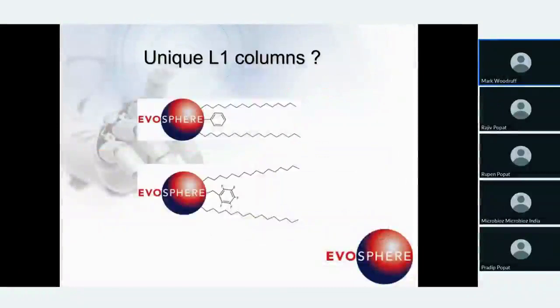So I said a moment ago, which of these L1 columns would you choose? Well, that's a good advantage to have, that there are multiple choices here. Traditional C18 columns, so your Hypersil Golds, your Fortis C18, your SunFire C18s, your Luna C18s, are predominantly C18 ligand with a hydrophobic end cap.